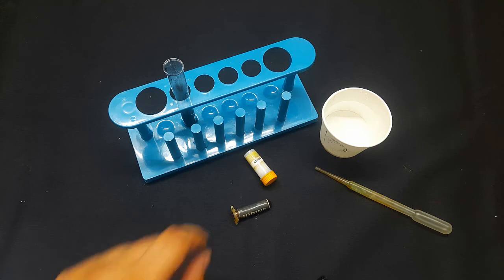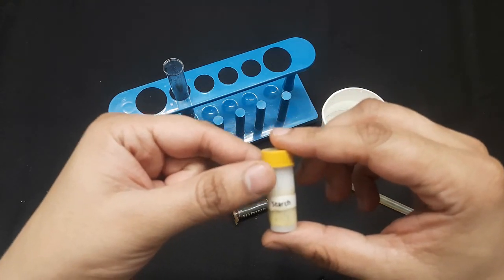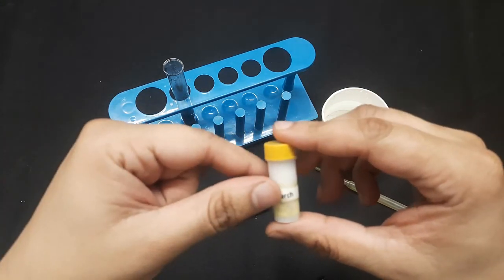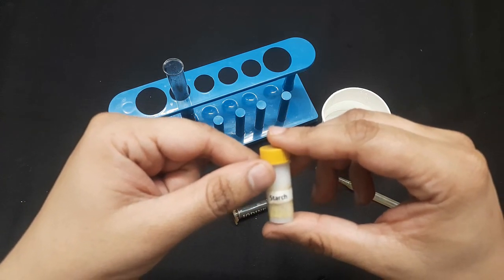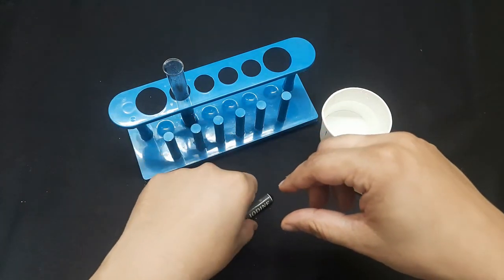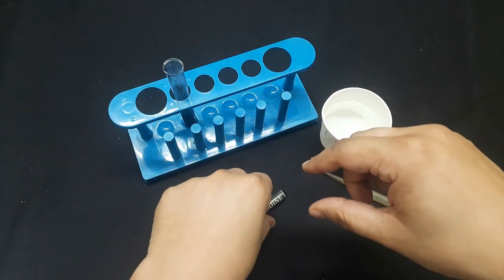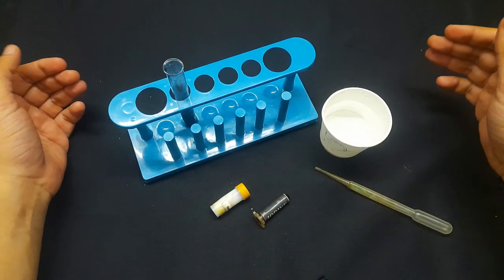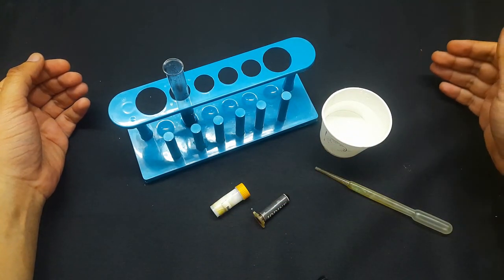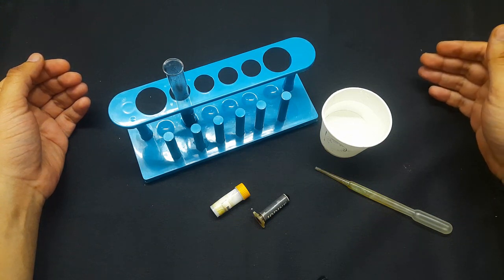So firstly, we have to take the starch powder in a test tube, and after that we have to mix the water so that we can make the aqueous solution of the starch powder. And after that, we have taken 2 or 3 drops of iodine and we have put them inside the test tube, and if the color changes to deep blue or black, it shows the presence of starch in that particular food product.